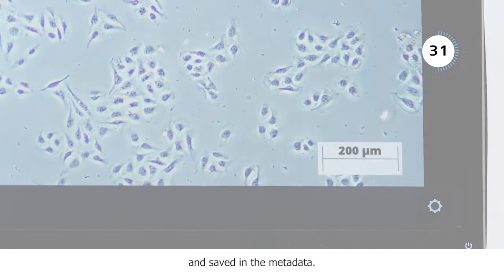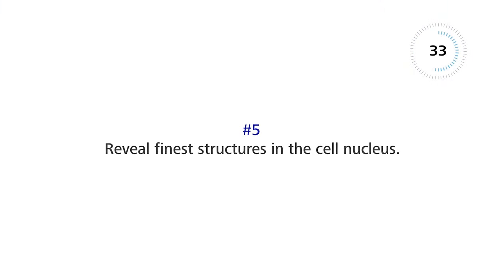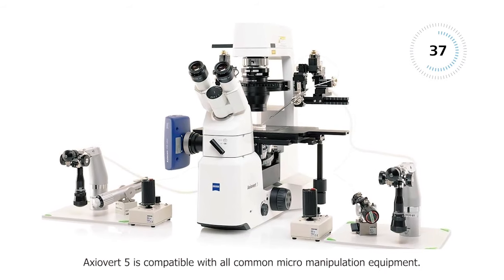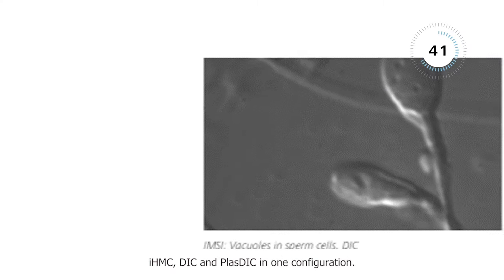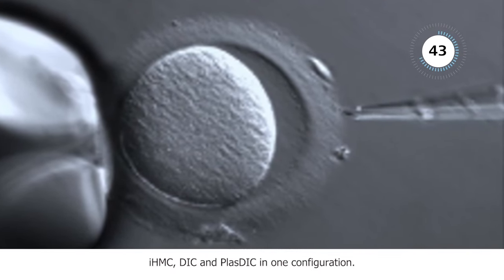Axiovert 5 is compatible with all common micromanipulation equipment. You can combine IHMC DIC and PLOS DIC in one configuration.